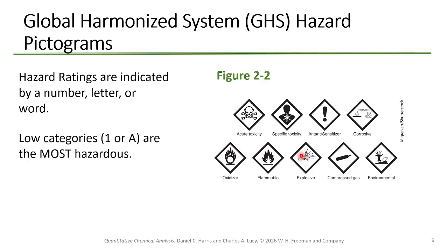So, yeah, this must be GHS, because see how it's corrosive, highly corrosive, target organs, respiratory system. My guess would be that's GHS, but you'd want to actually look. It should define it somewhere in there if you read it through.